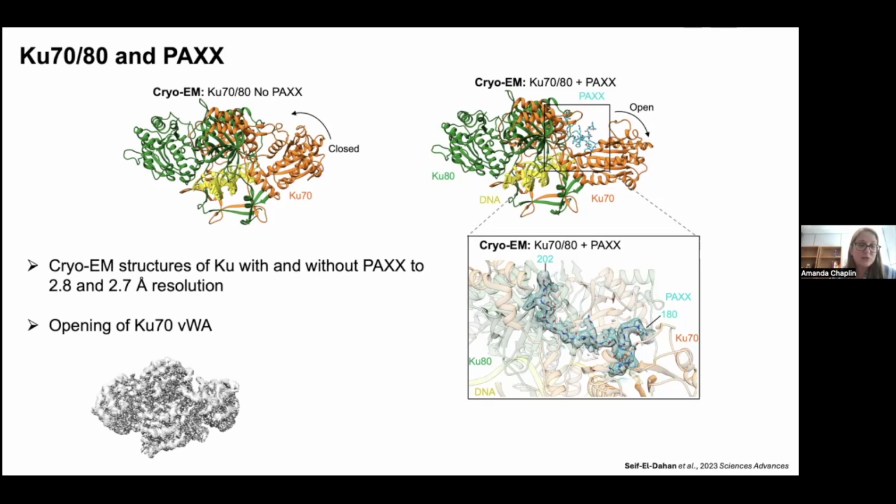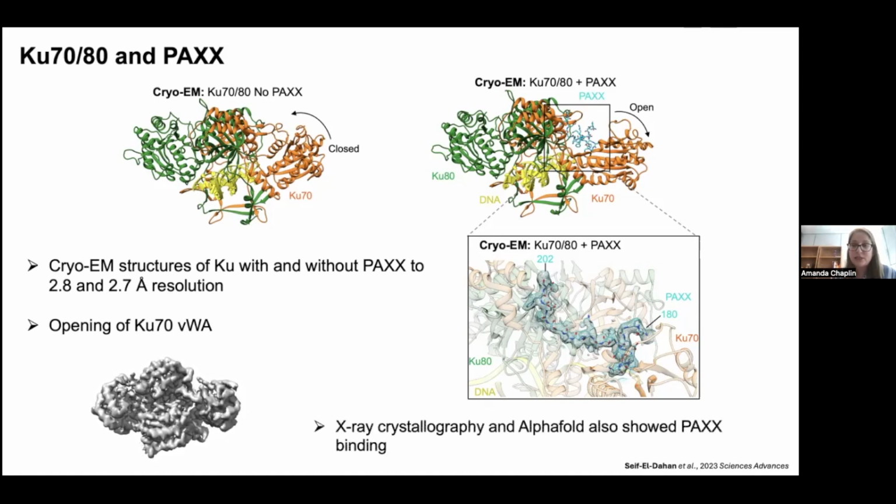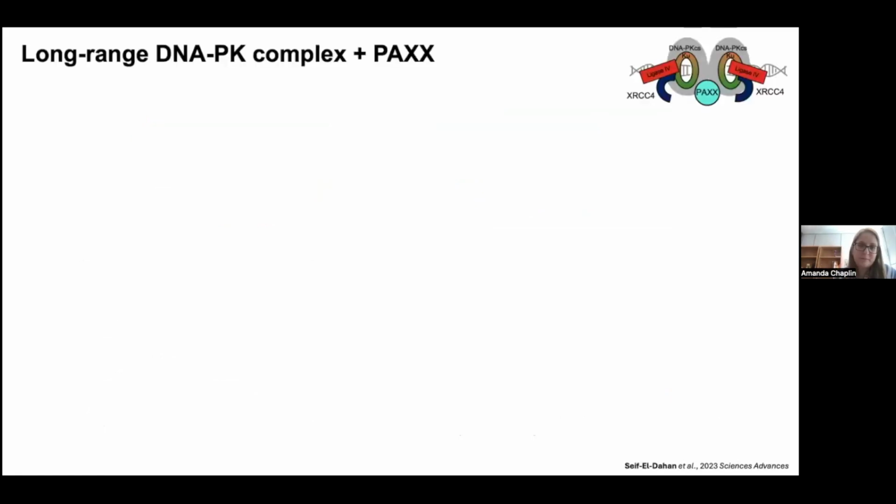And so, yeah, we can see this really nice opening, and this video just kind of shows it to you. This is with and without PAXX binding, how the protein is really opening up to accommodate PAXX. And we did this in collaboration with Professor Charbonnier in France, and he did some X-ray crystallography experiments as well, showing the exact same thing of PAXX binding. And AlphaFold actually also confirmed it once we had told it the particular region that we were looking at.